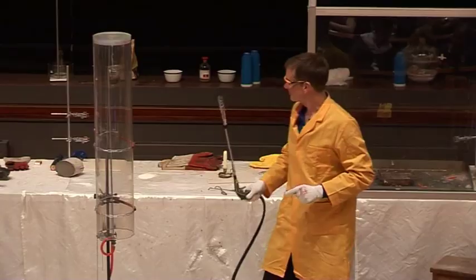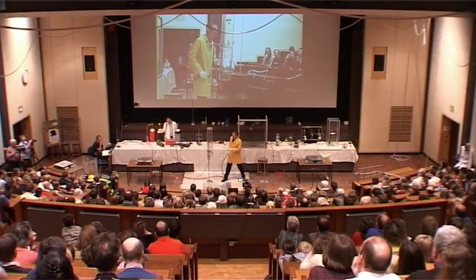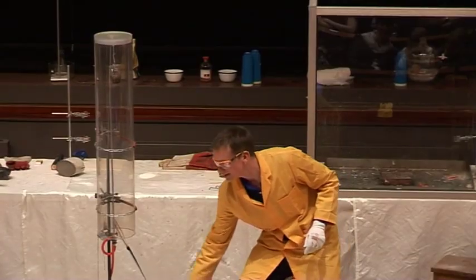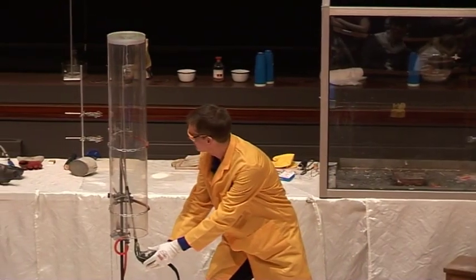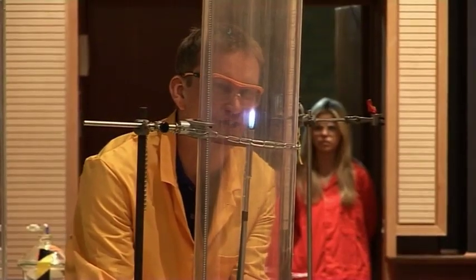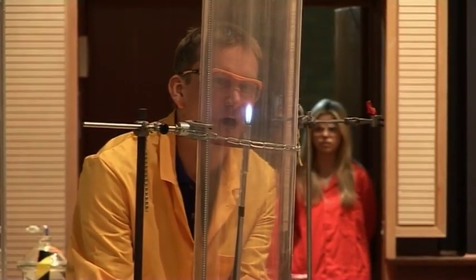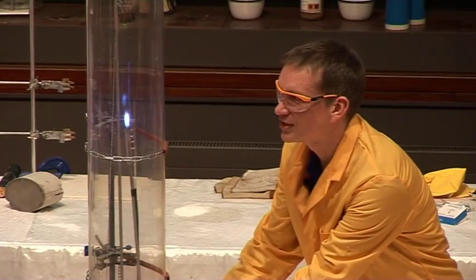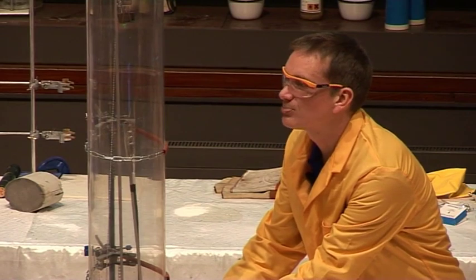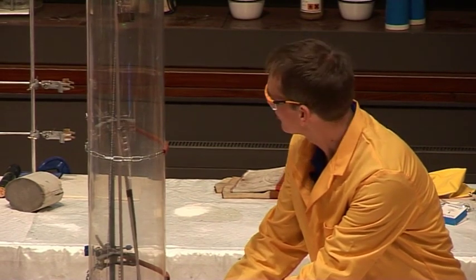So ready? Need to check here. And fireman Nick is on. Yes, good, thank you. Right, okay. So, we're in. Sparker on, and oxygen, and there we are. So this is oxygen gas burning in hydrogen, which is actually pretty good, really. So oxygen itself doesn't burn in air, but it does burn in hydrogen. Okay, off.